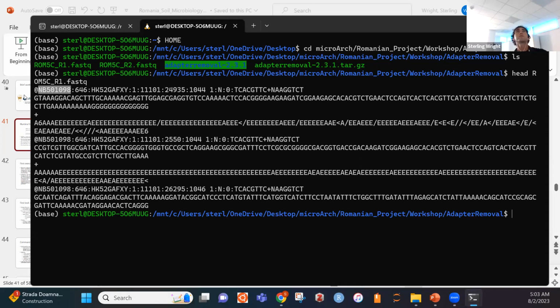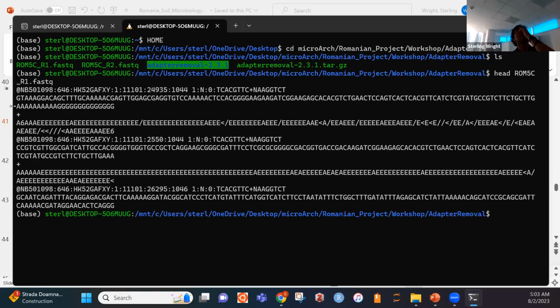And then what we have here is our Gs, Cs, and Ts. Now, like I said, it's only supposed to be one line, but my terminal is only able to be at such a size, so it's pushing this line onto another line here. But you can think of it as this line keeps extending.